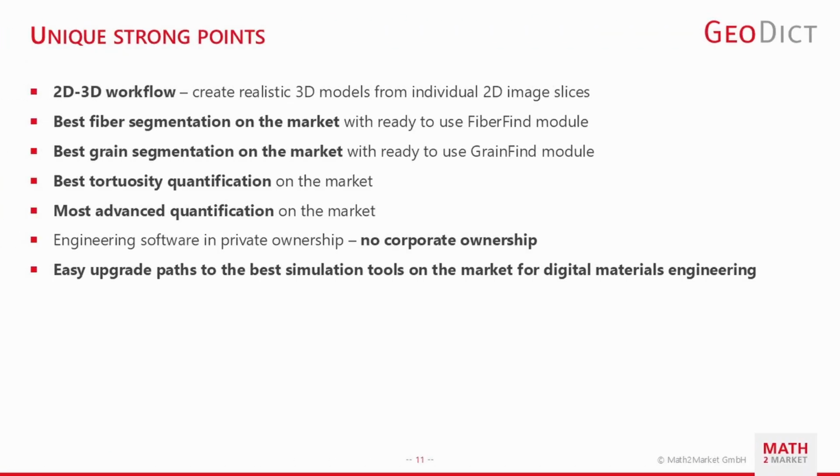Finally, here are the unique and strongest points where GeoDict outperforms the competition. These include optimized modules for fibers and grains, tortuosity quantification, and unique tools for materials scientists.